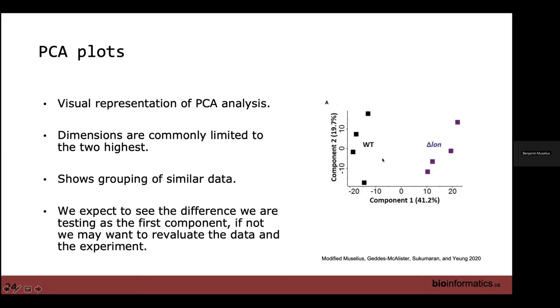In terms of actually creating the plot, dimensions are commonly limited to the highest two. You could certainly do three as well if you wanted to, but two is kind of the standard. We expect to see the differences based on what we're experimenting on.